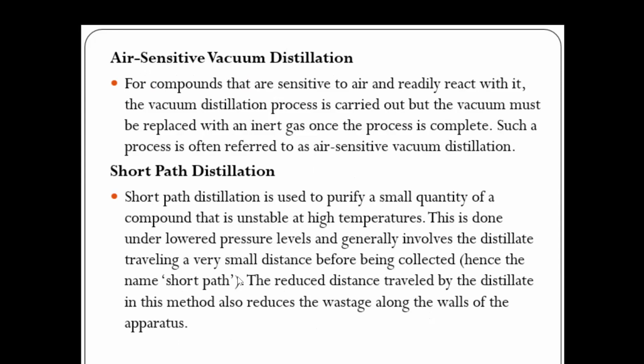Some components readily react with the air particles or air molecules, you can say. The vacuum distillation process is carried out, but the vacuum must be replaced by an inert gas once the process is complete. Such a process is often referred to as air-sensitive vacuum distillation.